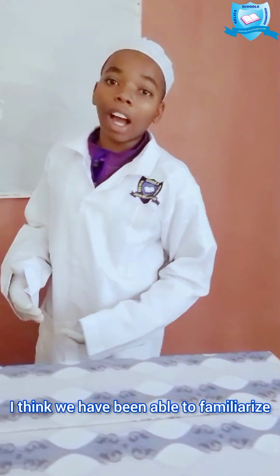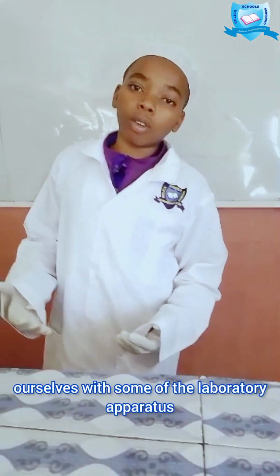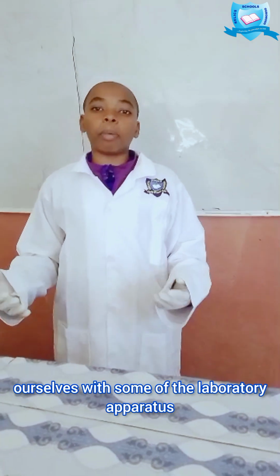I think we have been able to familiarize ourselves with some of the laboratory apparatus.